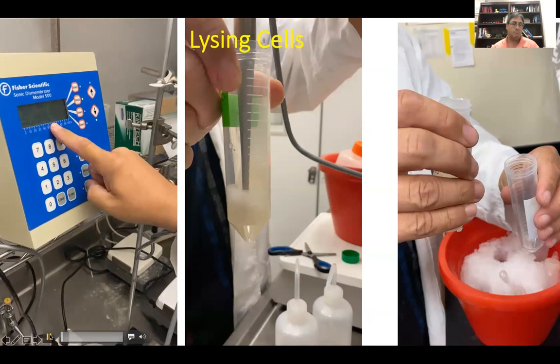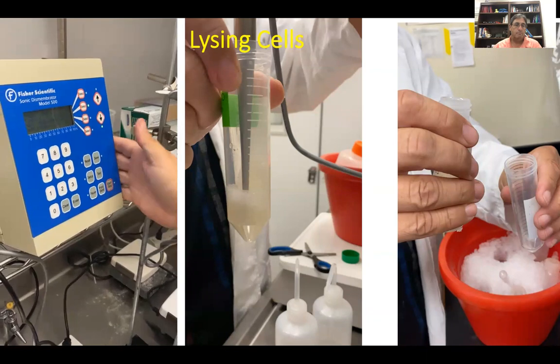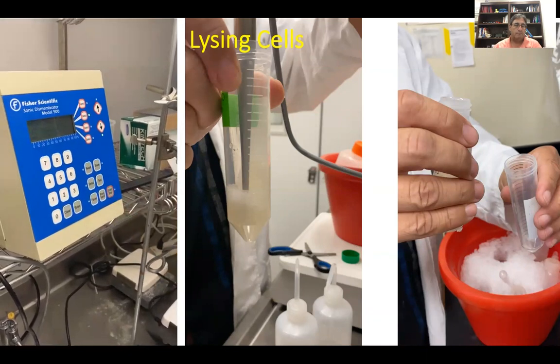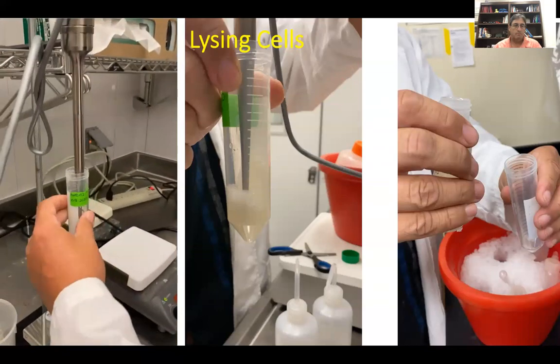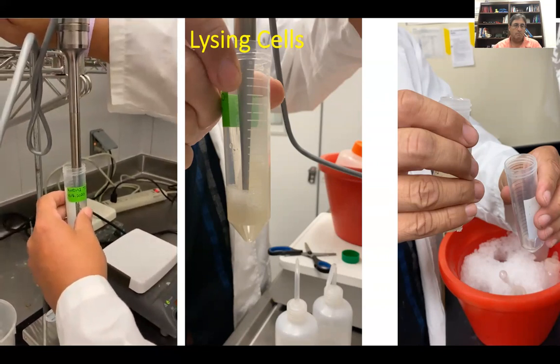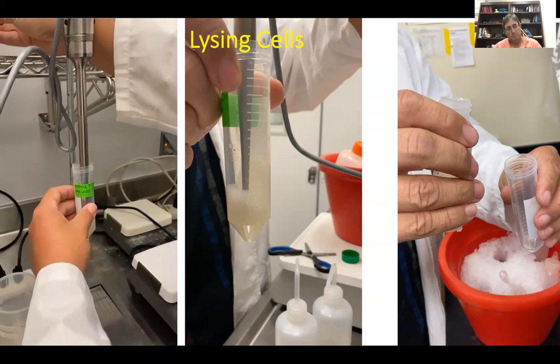Start low, adjust by turning up and down, on and off here. So there's the tip in here, so it's suspended. Do not touch the tip to the side. And then increase the power.